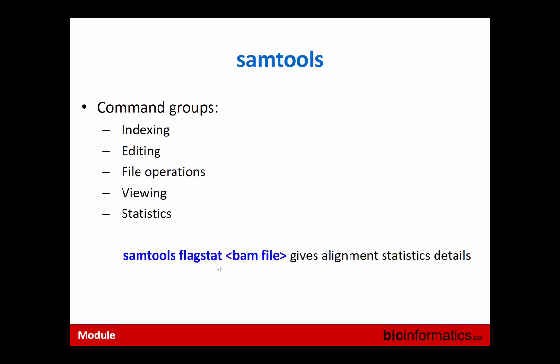So now we're coming to some tools. SAMtools is a C program used to manipulate BAM and SAM files. It has lots of options. In the lab we will do it: if you just type samtools, you will see that it gives you help. Most of those bioinformatic tools, by the way, if you're completely stuck and don't know what to do, just run them with no parameters. It gives you some help.